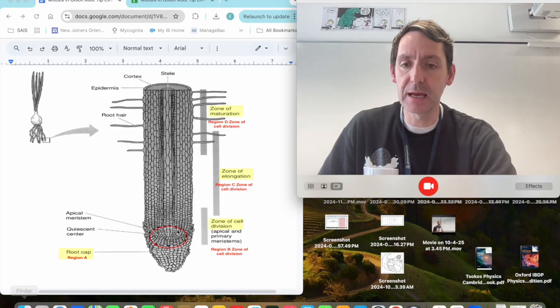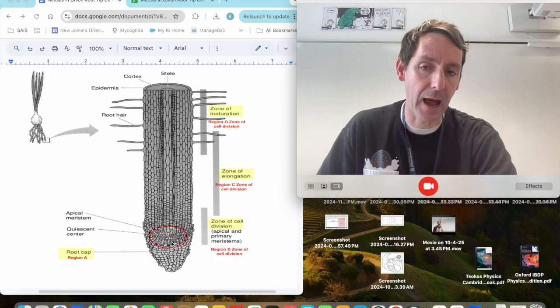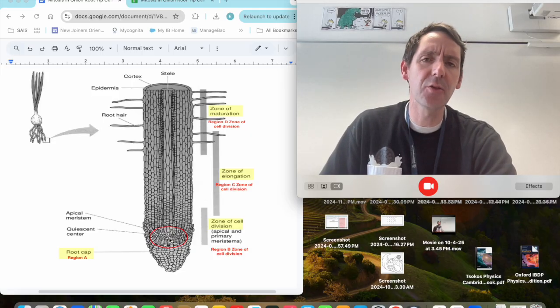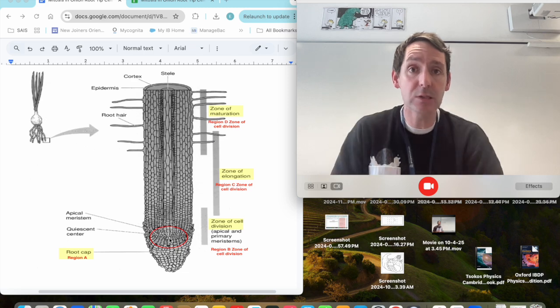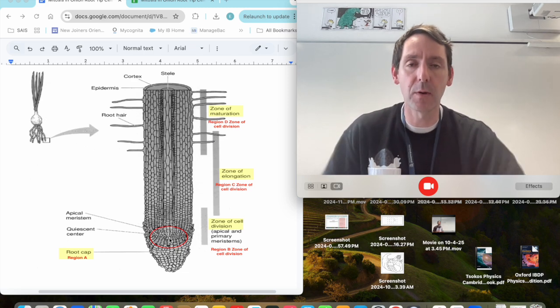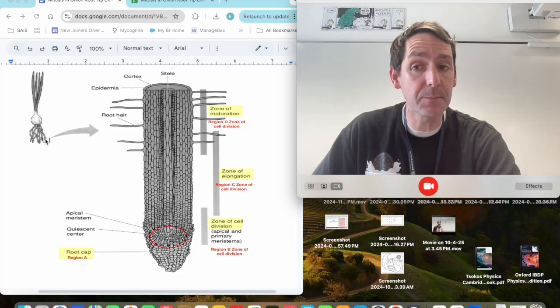We have then a second region right below the cap, and you can see that there's a whole lot of little itty bitty cells there. The reason why is because there's a lot of division happening. So the cell grows and divides and divides and divides, so we expect a very high rate of cellular division there, right? And then we have here in the middle, now we say the middle, but remember this is still on the very tip of the root.